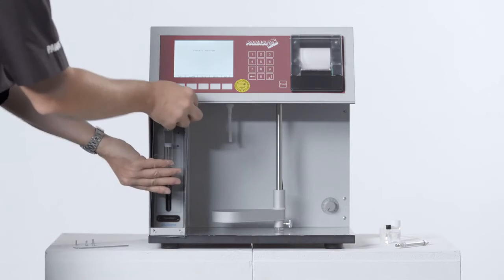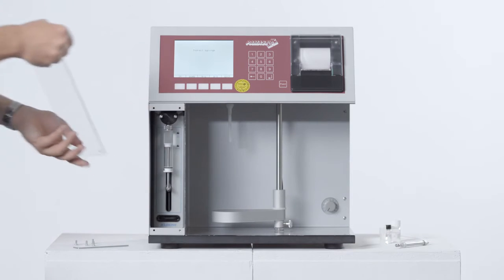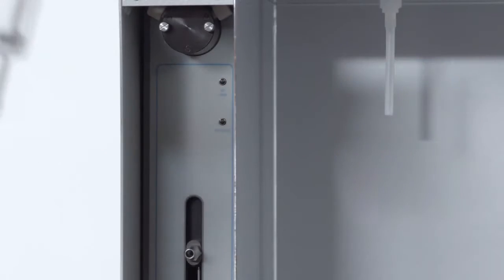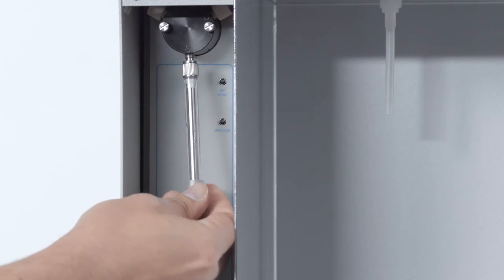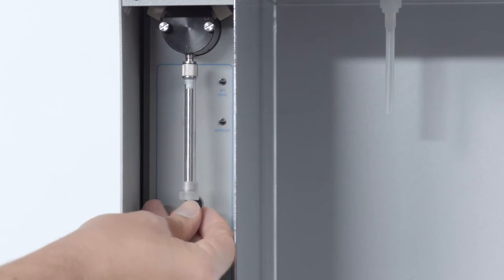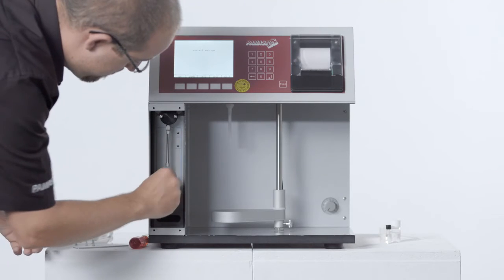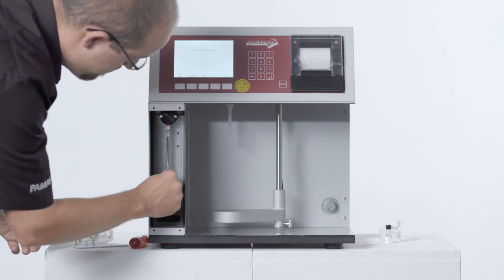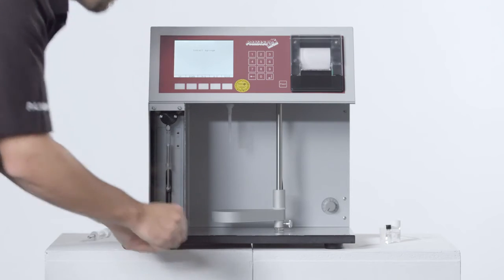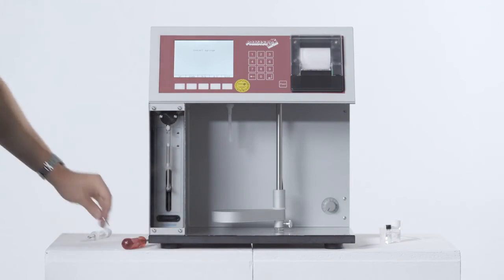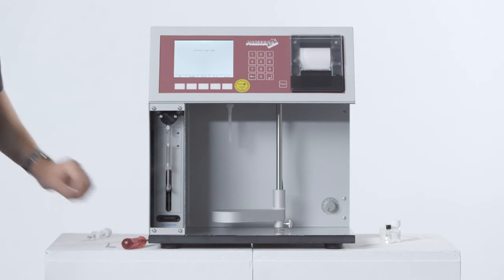For utmost accuracy, the syringe for flow rate control is exchanged as well, so it ideally fits to the smaller sample volume. It only takes about 2 minutes and a few simple touches to exchange the syringe.